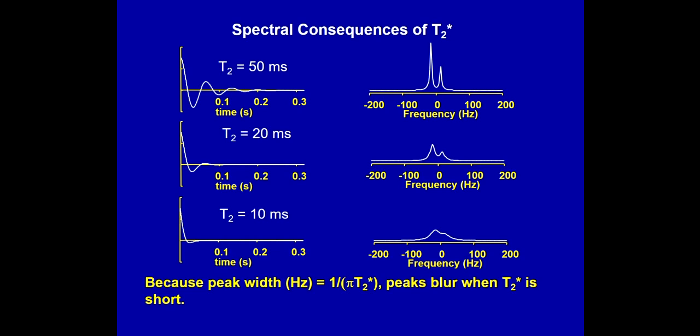These peaks are not really separated anymore. They're beginning to blur together. And with peak fitting, you could make a pretty reasonable estimate of these two peaks, but they're not so clear as they were with the long T2.